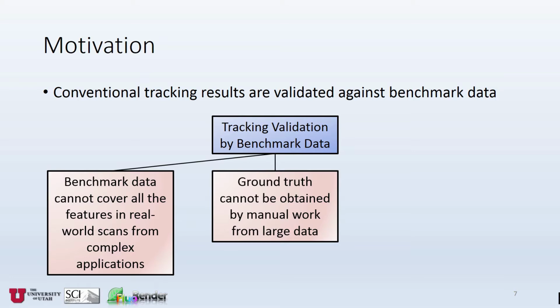However, manual work is the only method available. For large and complex 4D data, it is simply impossible to generate the ground truth by manual work. Also, if we can generate the ground truth every time, there is no need for an automatic tracking tool.